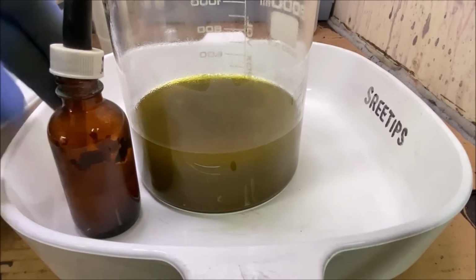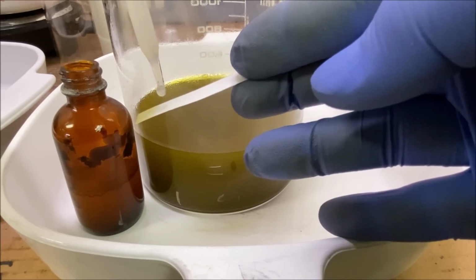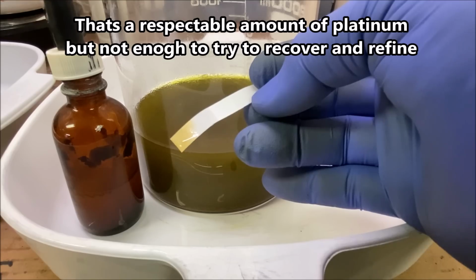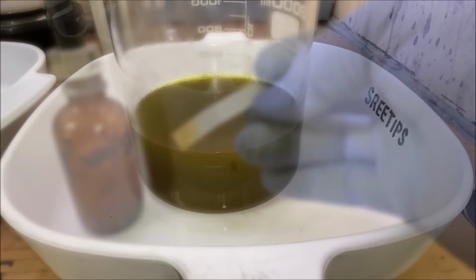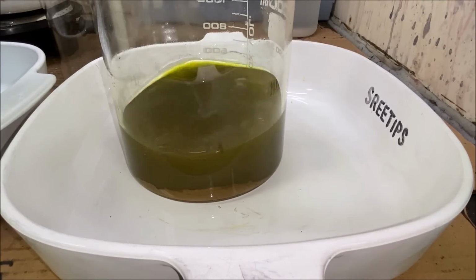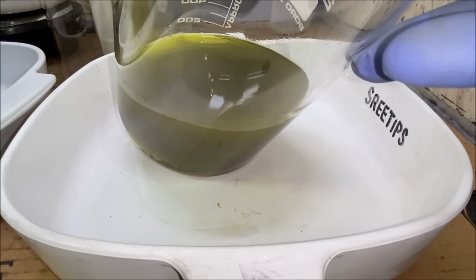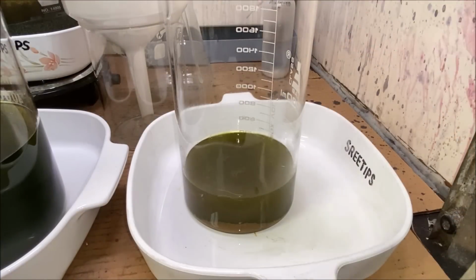All right, I'm going to do a quick stannous test, see if we got all the gold out of here. I don't think we do. I still see yellow color. Well, maybe we got all the gold. That looks orange, which tells me we got platinum left in that solution, and all the gold looks like it's been dropped. All right, this was 400 milliliters of solution that we precipitated the gold out. Get an idea what we can expect from the rest of the solution. I've probably had about 2 liters of solution, so didn't see a whole bunch of excess nitric.